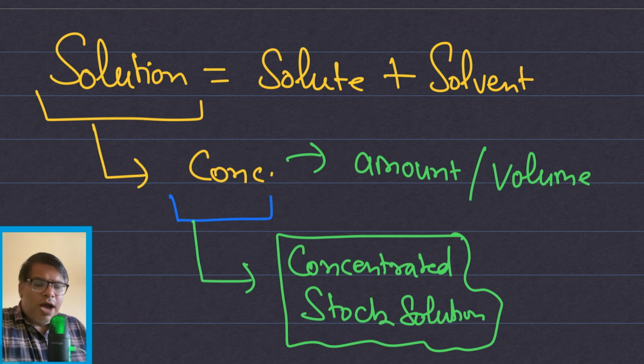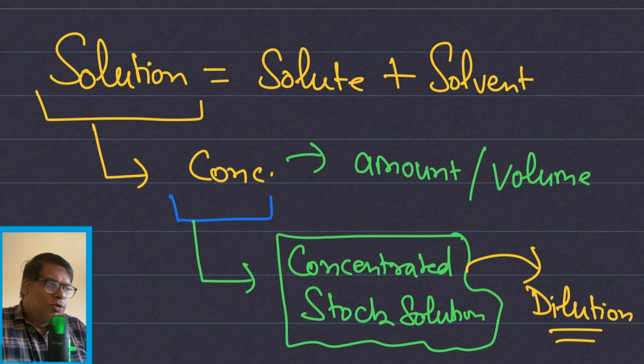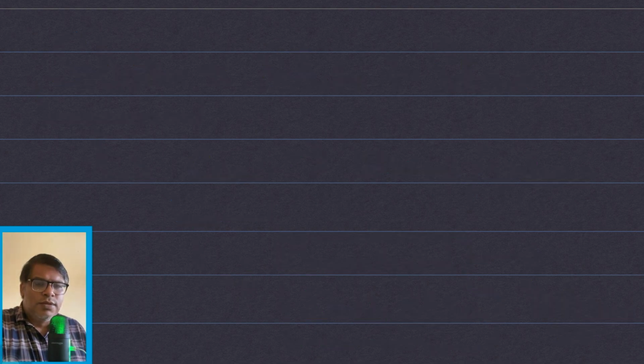In this video, I will also teach you how to dilute your solution: how much of the concentrated stock you take and how much water, the solvent, you mix, so that you get the desired concentration of the working solution. So you are going to learn two things: how to prepare the percent solution and how to dilute it.